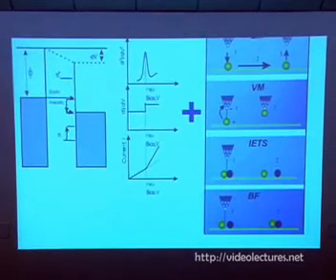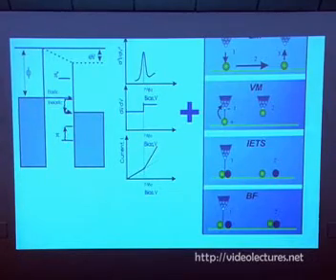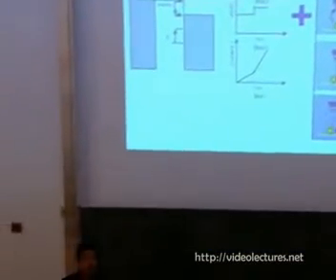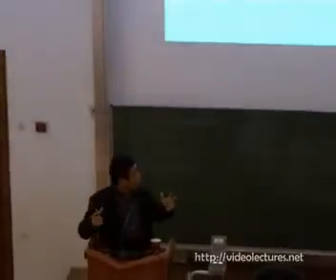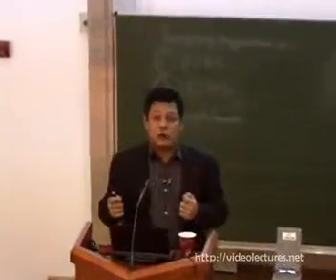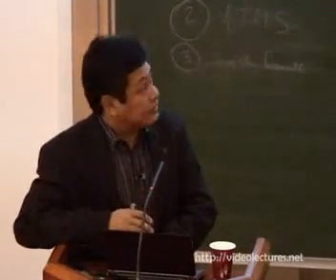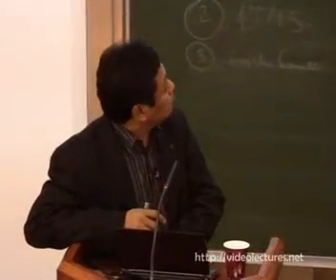a plenty of choices we can use to study the electronic, mechanical, physical, and structural properties of individual atoms and molecules, so that we can see whether this molecule will be fit to create a device, which I'm going to show you with 4 recent examples from our group.